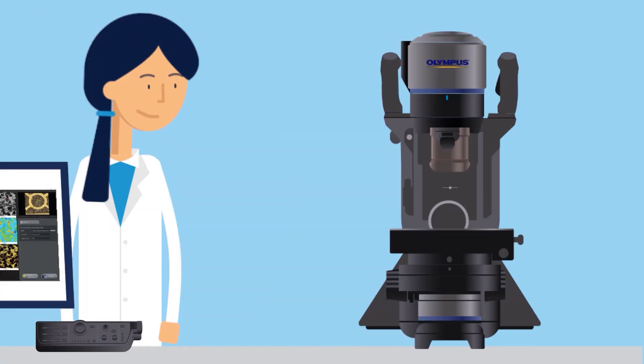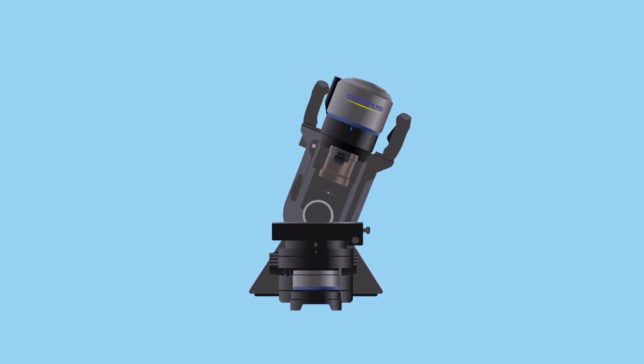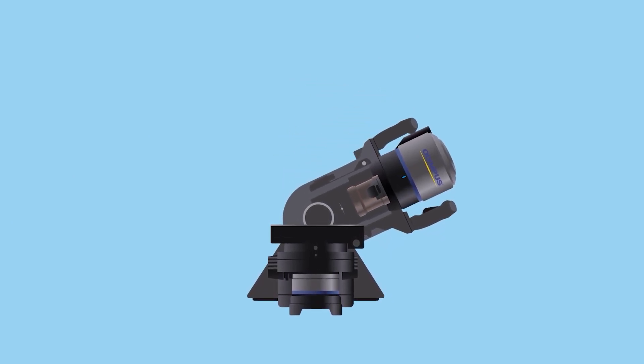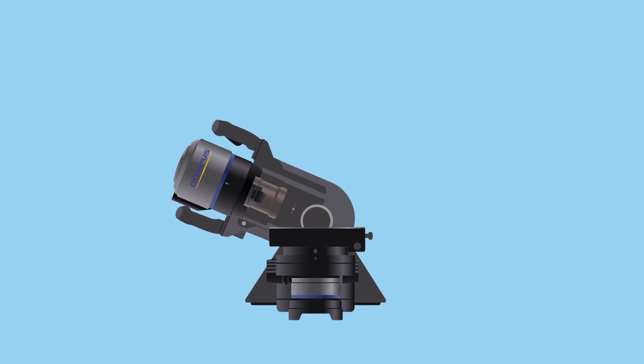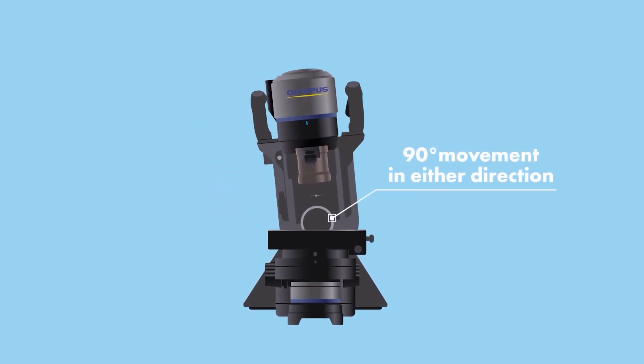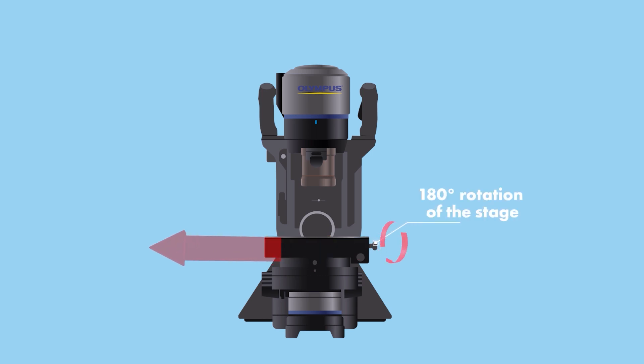With its free angle observation system, Olympus's DSX-1000 Digital Microscope allows you to see your sample in many angles. The rotating observation head enables 90 degree movement in either direction. The stage also rotates 180 degrees so hard to spot defects are easier to find.